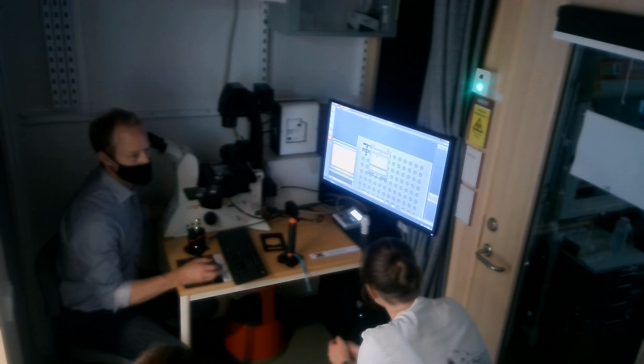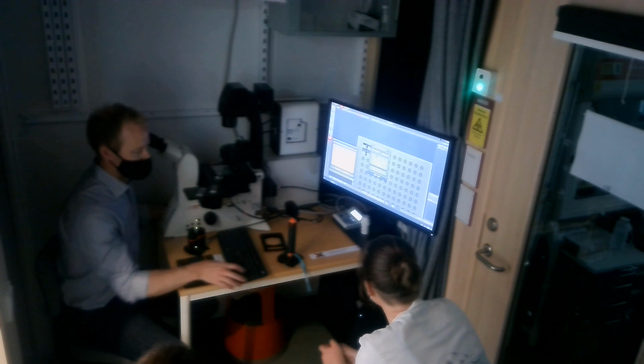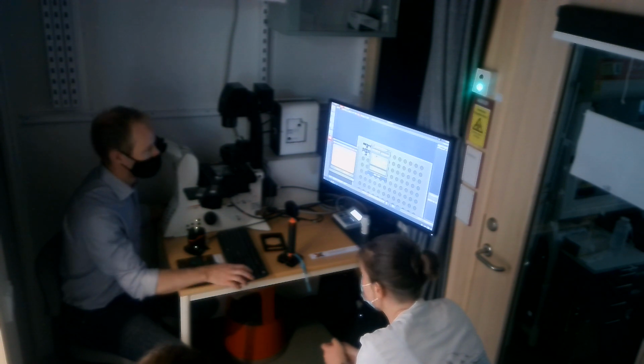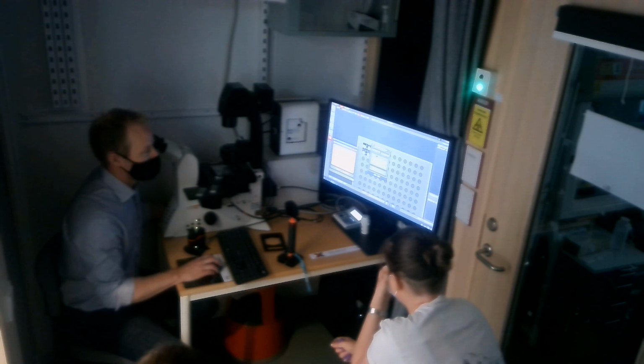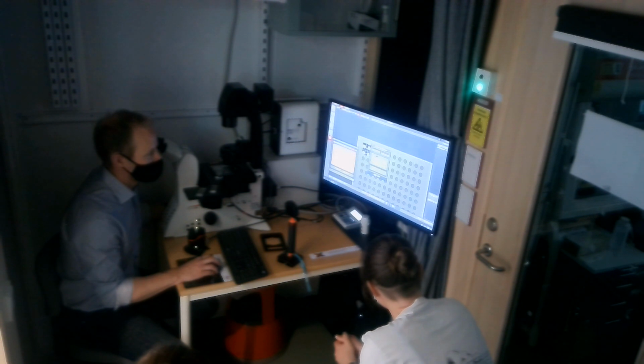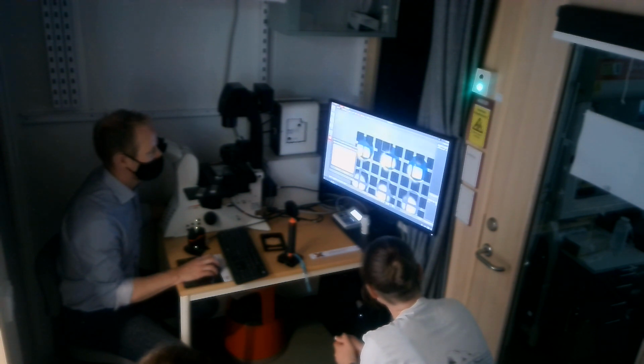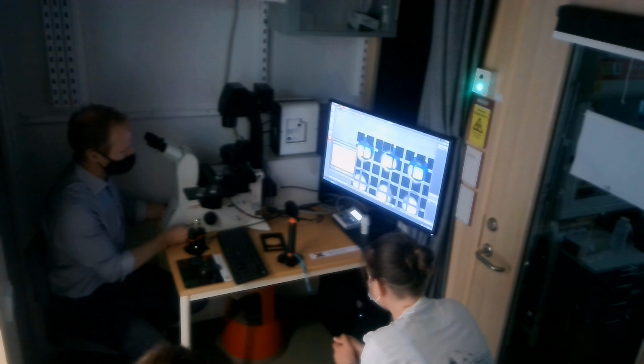How many would you do in each well? Maybe 9 or something. With the 40x. Yeah, maybe 9. You can do 9. Random. Yeah. Well, that in the center. A little bit more towards the center. We drag it over there, and we go OK. So now we can zoom in here. And of course, I made a mistake because I'm on the 5x still.